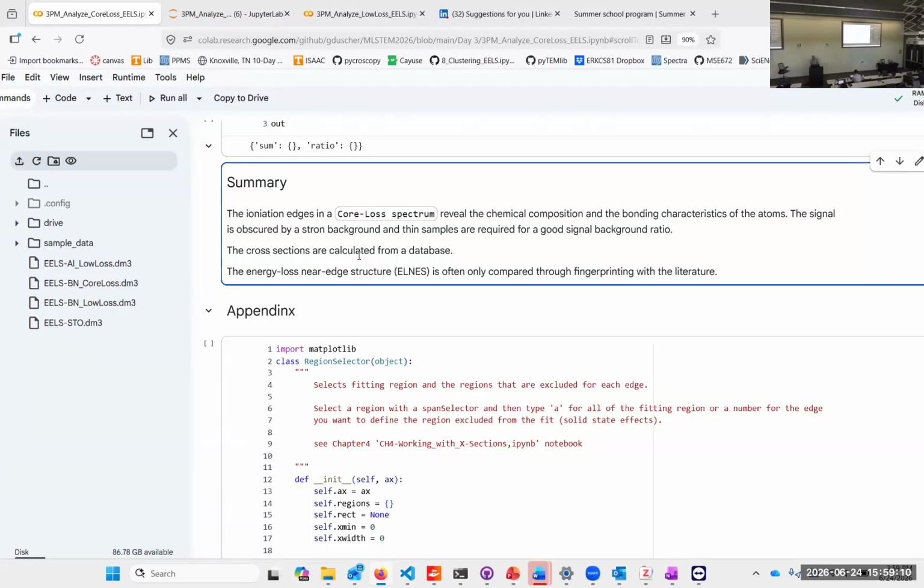So the thickness estimation is based on the Drude theory to fit N-log term. How does it compare to the ratio method T over lambda, where the lambda is estimated from the elemental? I did not do that with the N-log term. I really did it with the multiple scattering term. So with the Poisson statistics from the single scattering to the multiple scattering ones.